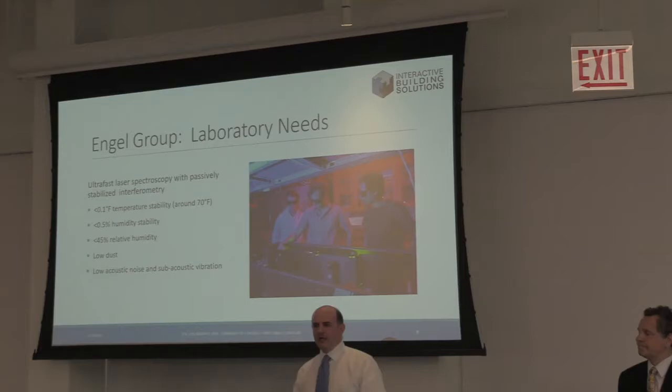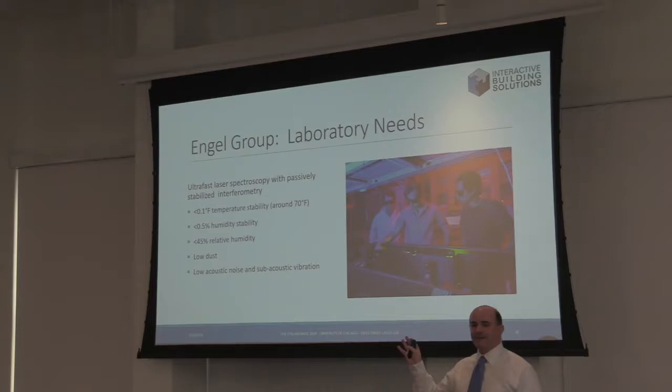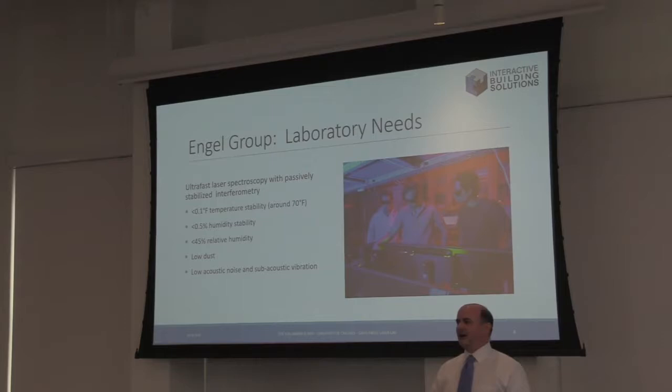So the temperature, not so bad. 70 is good. You don't want an uncomfortable lab. So that one's pretty easy. Humidity, do you want to try and lock it at 45%? Do you want to try and lock it at 30%? Chicago's a rough place to do this. When I was in Berkeley, California, and it was always 15 to 18% humidity outside, it was pretty easy to think about what's going to happen, except the month of December where it rains, which means you take off and go to the coffee shop or whatever libation you might prefer. But in Chicago, you know, we have things like summer and winter, which California doesn't really have. And that makes it a much harsher decision.